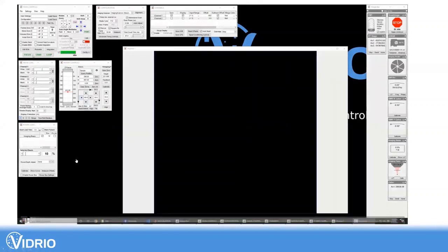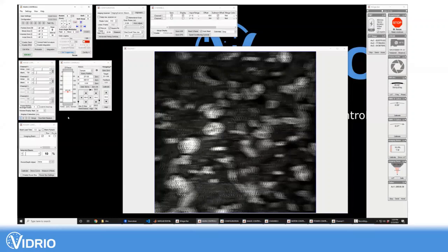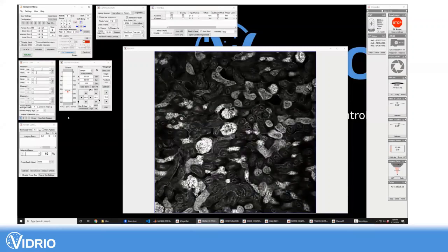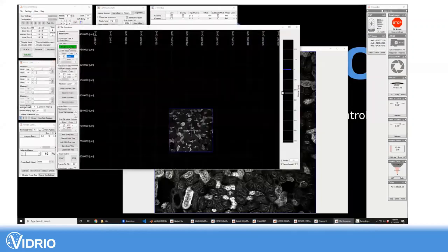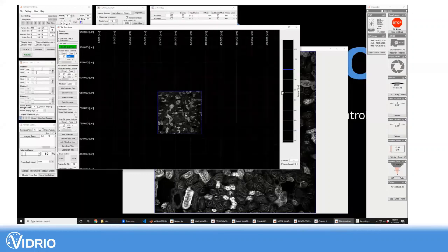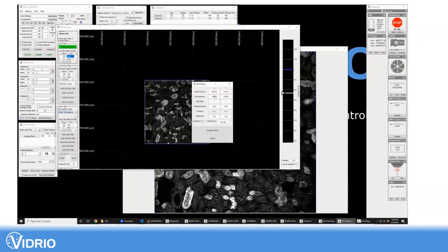And so basically, you can see first you would do a focus to get an image that you want to look at or center around. This is just a kidney slide on our confocal microscope, and then you'd select this new tile view, and you disable the live view, and so you've now got your initial image in the center. And now you can draw the tile or configure the tiles that you want to get around that initial image.